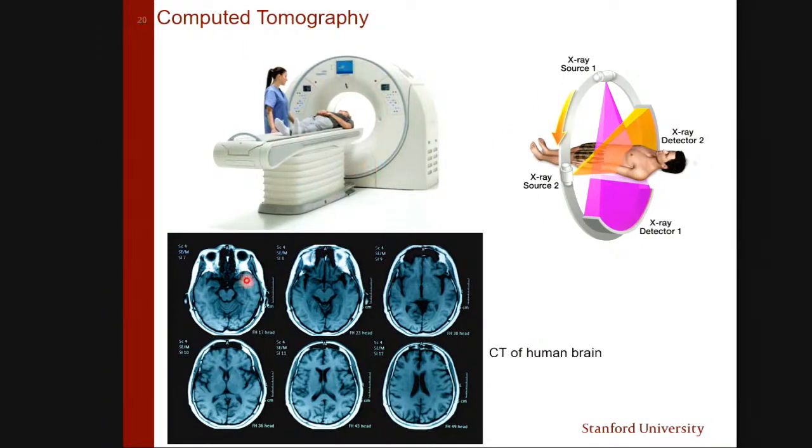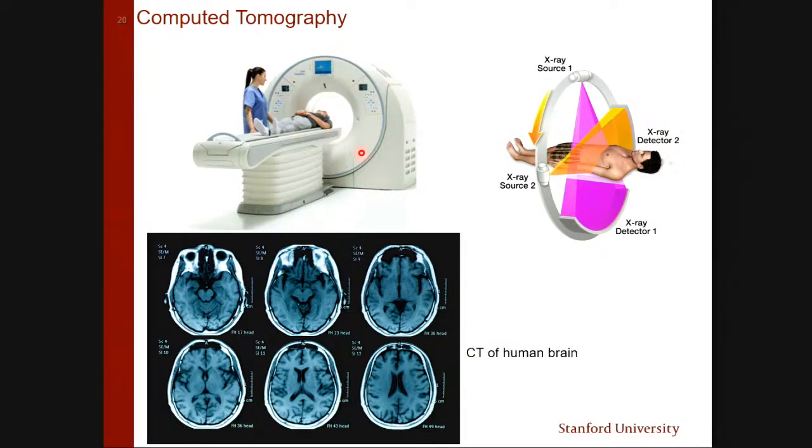because you can really see, for example, you can investigate the brain, you can investigate bone, like knee, for example, if the cartilage is broken or something like that. You can do also magnetic resonance as well. But X-ray is also very powerful. You can then see a three-dimensional image of your body, for example.